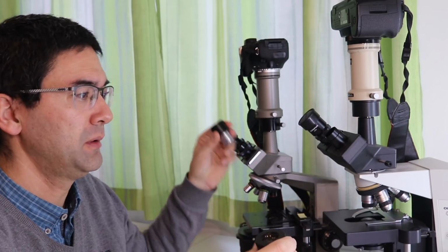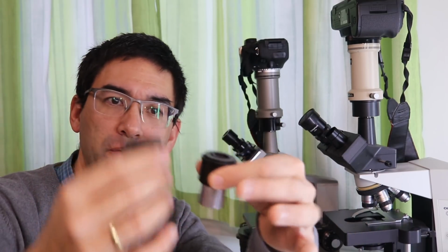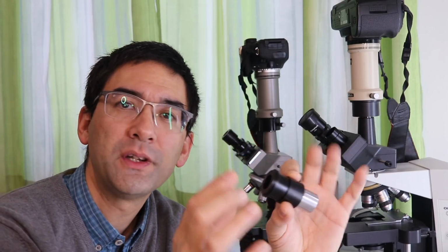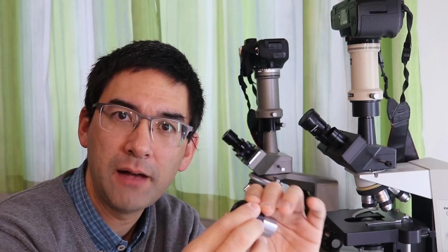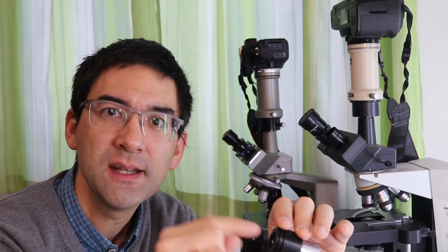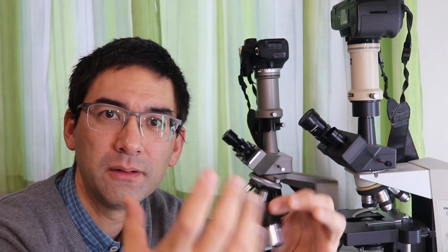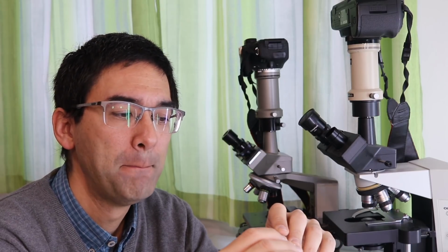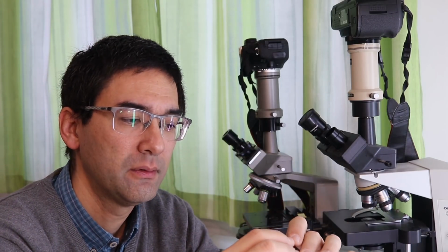I mean, this one, for example, you can see that it looks different, but actually it's the same principle. You can also extend the front part. By the way, there is another nice side effect of long eye relief eyepieces, because your eyelashes don't touch the lens, and then there is less oil and dirt on the surface of the lens, okay? So long eye relief eyepieces do have an advantage.